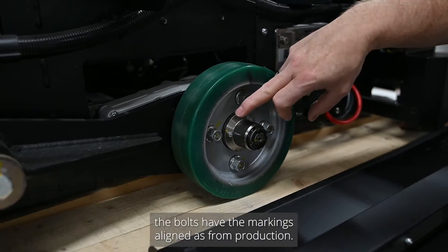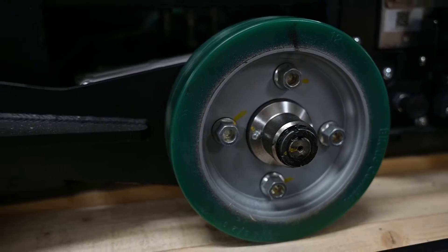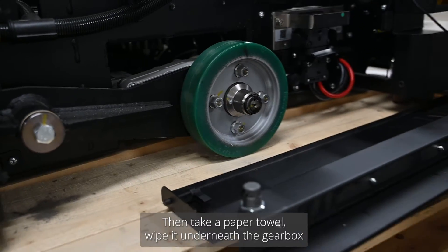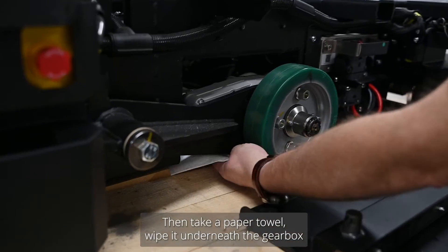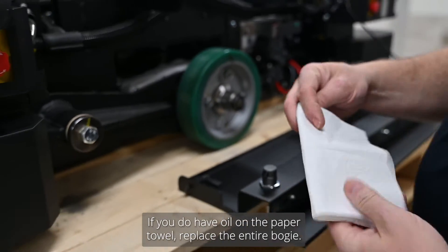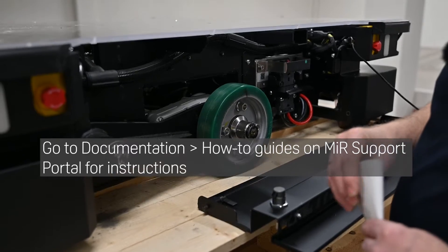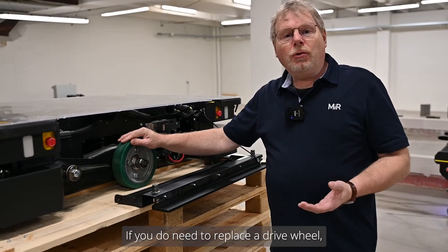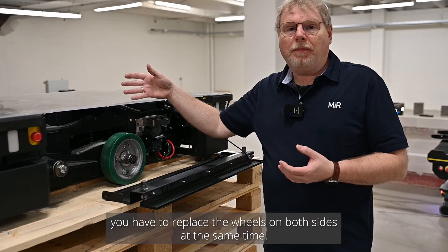Check that the bolts have the markings aligned as from production. While you are at it, take a paper towel and wipe it underneath the gearbox on both sides to ensure there are no oil leaks. If you do have oil on the paper towel, replace the entire bogie. If you do need to replace a drive wheel, you have to replace both sides at the same time.